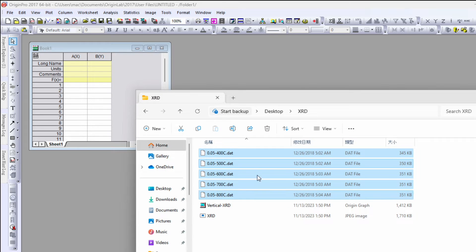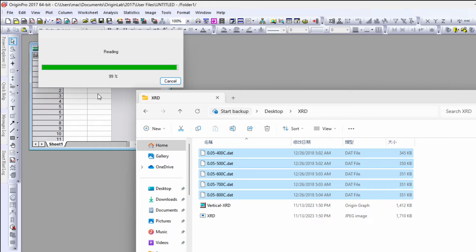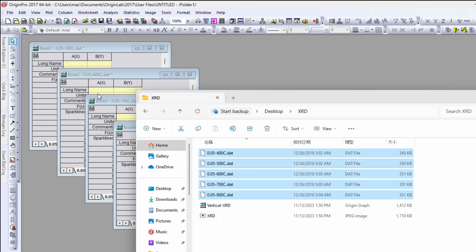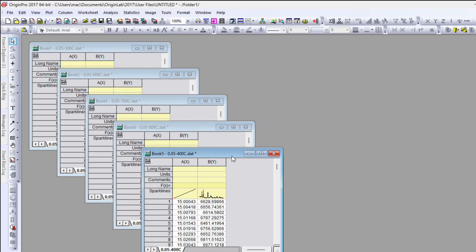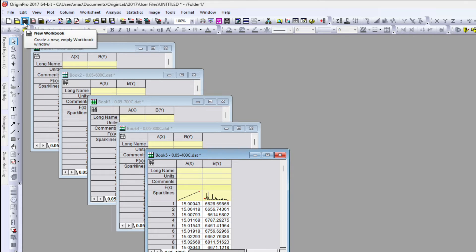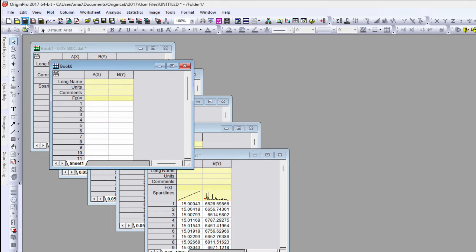Go to the file folder and drag the data files to the Origin software. I had a total of five data files and each file opens in an individual workbook, giving us five workbooks. Now go to the top left corner and click on 'New Workbook'.